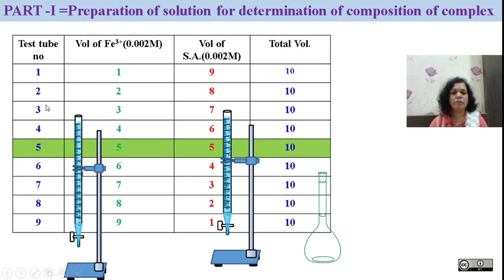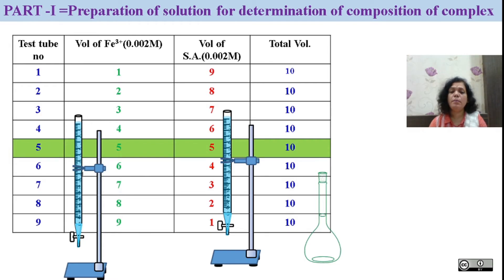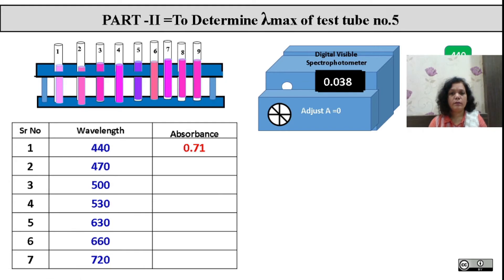We need test tubes number 1 to 9, where we are going to add 1 to 9 ml of Fe3+ solution. In test tube number 1, add 1 ml of iron solution and 9 ml of salicylic acid. The total volume is kept constant, and we do variation with iron and salicylic acid solution — this combination forms a complex of iron and salicylic acid. We choose solution number 5 — 5 ml of iron and 5 ml of salicylic acid — to find out the maximum absorbing wavelength for this complex.